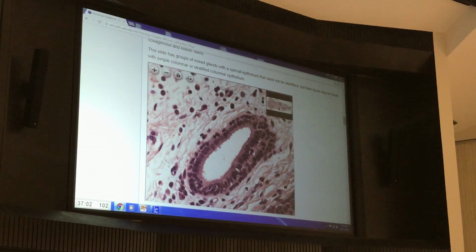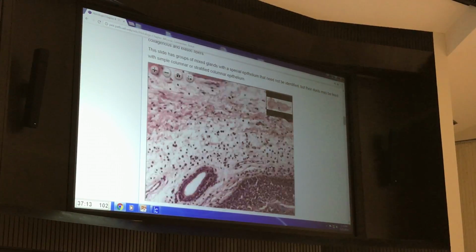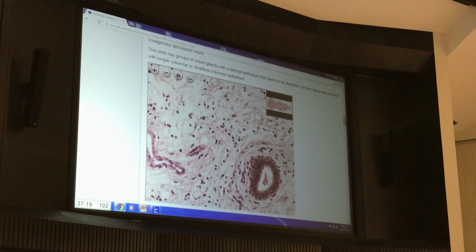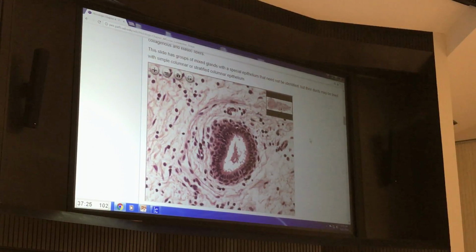Oh, here's, yeah, that's probably still a cuboidal the way it looks, but stratified cuboidal. But again, can you see this is a loose connective tissue? More cells, more space, much less fiber. It's on its way to looking columnar, but I wouldn't hold us to it.